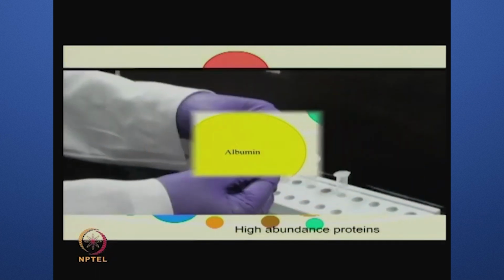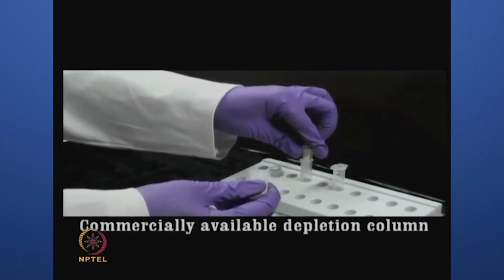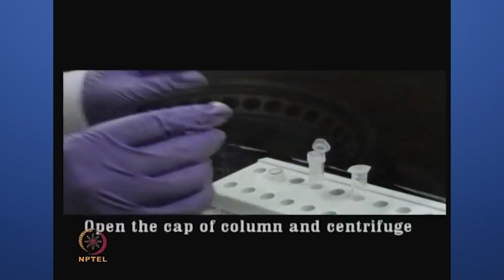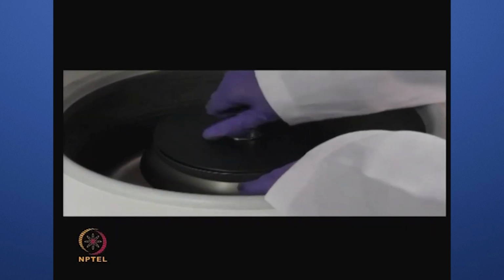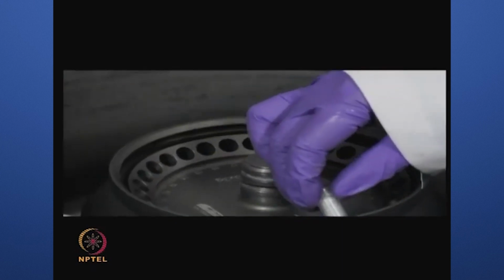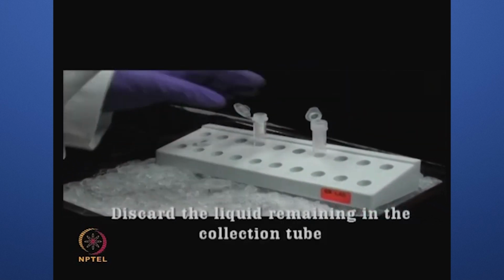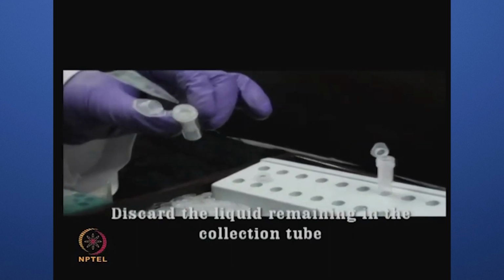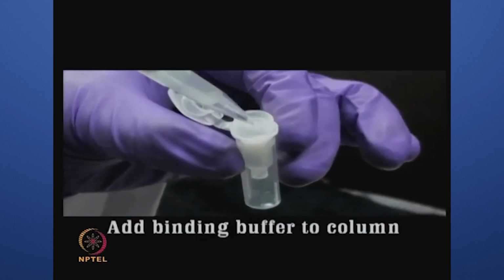Depletion columns for removal of high abundance proteins are now available commercially. Open the cap of the column, place it in a tube and centrifuge it after addition of phosphate buffer. Discard the liquid that remains in the collection tube. Then add the binding buffer provided with the kit to the column and centrifuge the tube.